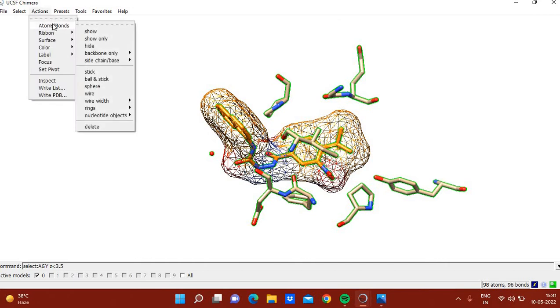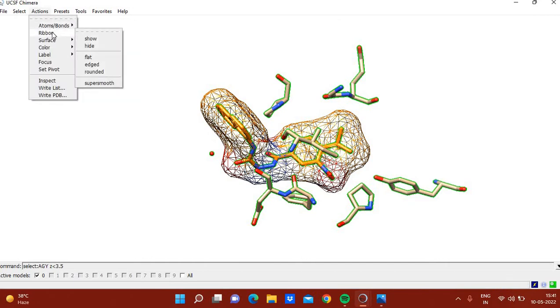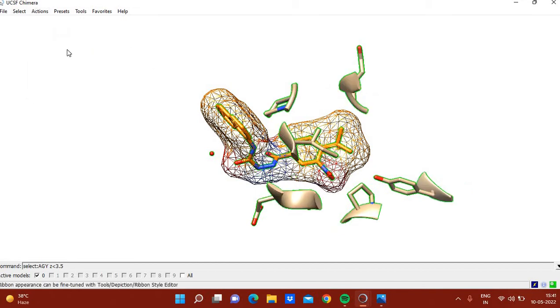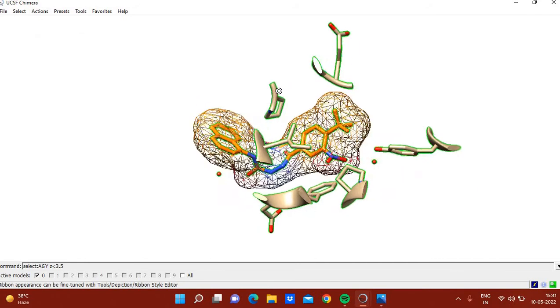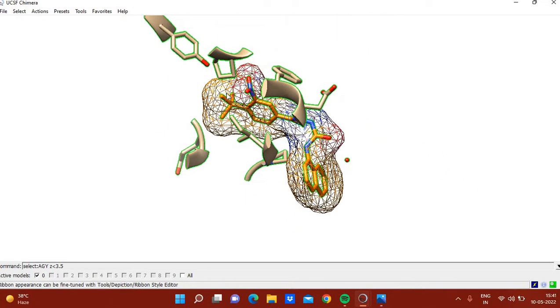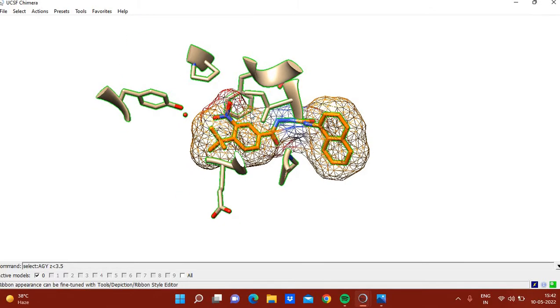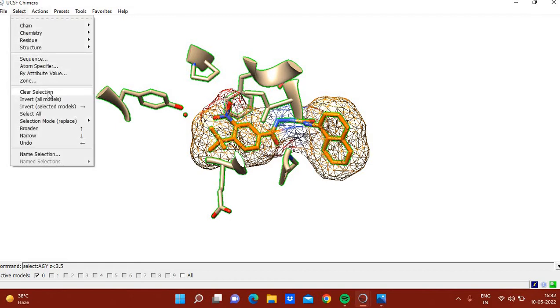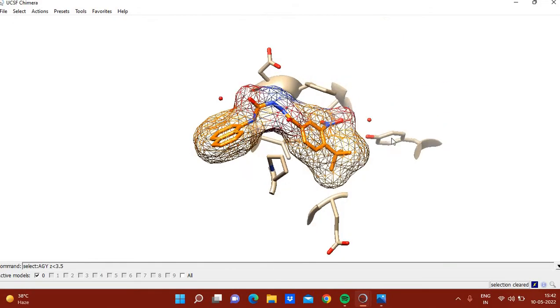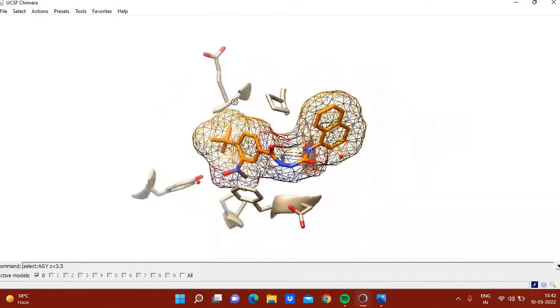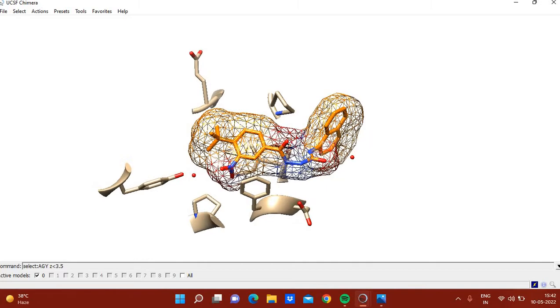If you want to hide the main chain and make the representation clearer, it's better to represent the main chain as ribbon. Click Actions > Ribbon, and now all main chains are in ribbon form while side chains are in stick form. Clear the selection. You can also try 4 Angstroms to include more surrounding residues.